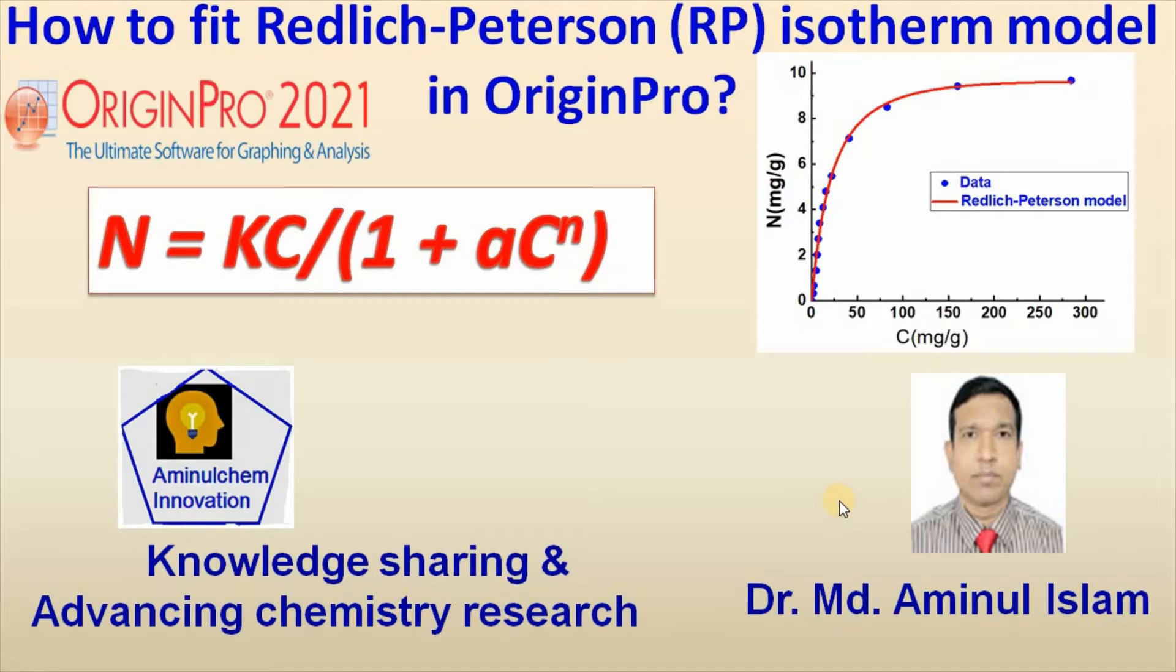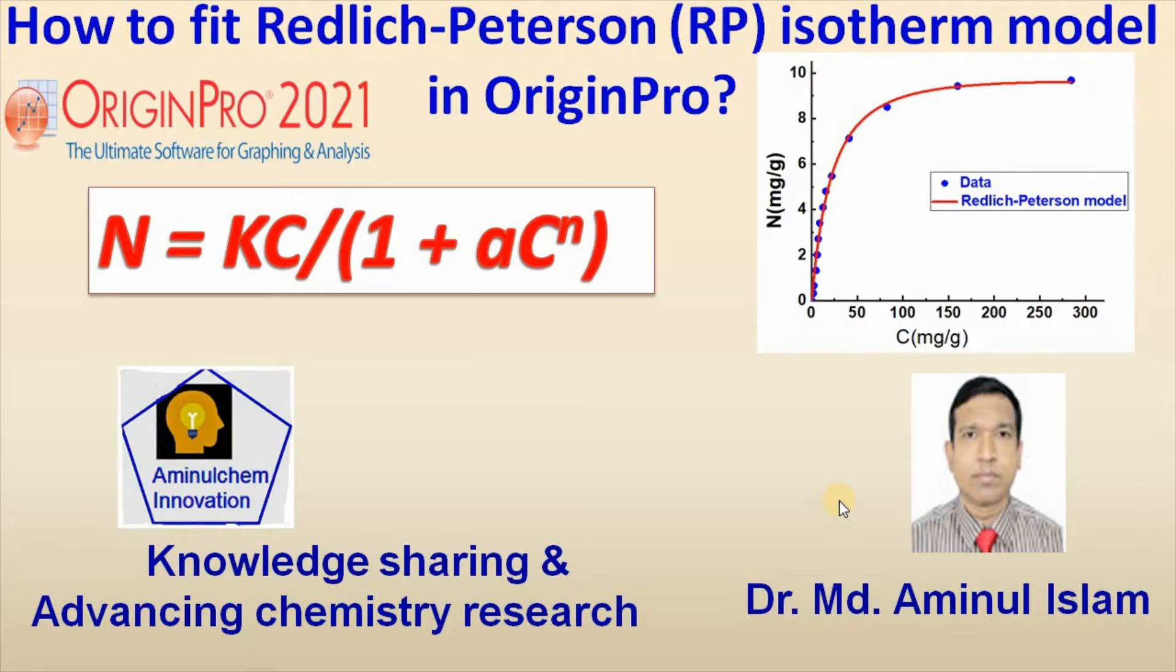In my previous videos, I showed you how to fit Langmuir, Freundlich, and Langmuir-Freundlich or Sips isotherm models using Origin. Today, I would like to show you how to fit Redlich-Peterson isotherm model using Origin Pro.